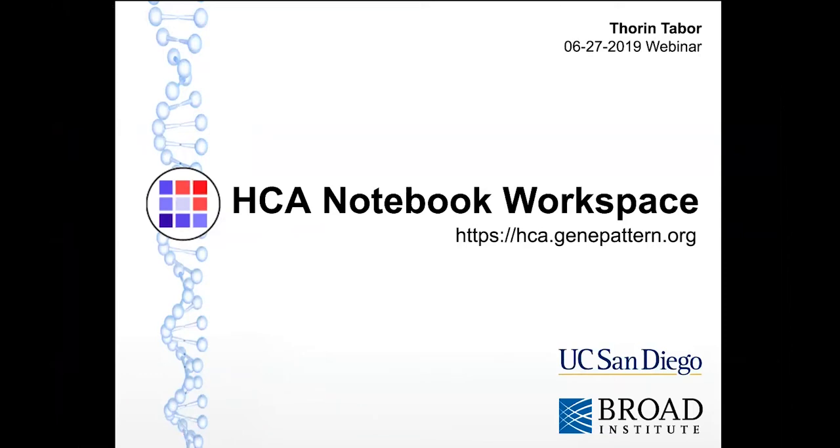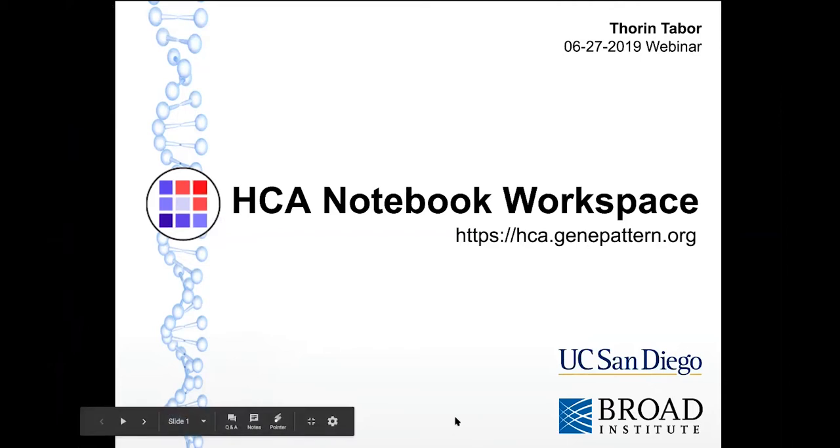Leading today's webinar is going to be Thorin Tabor, who is the lead developer for GenePattern notebooks. In our webinar, we're going to provide an overview of the HCA Notebook Workspace. Then we're going to take a deeper dive into a few of our featured notebooks. Then we'll review some additional features and future plans.